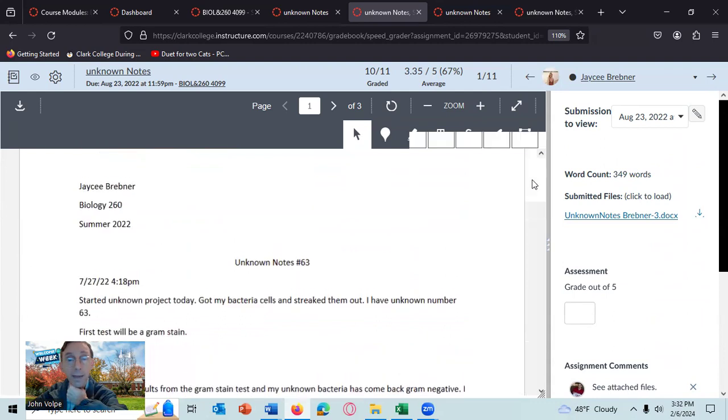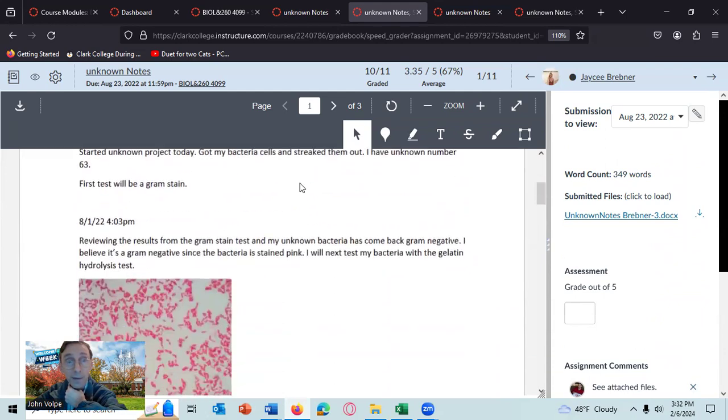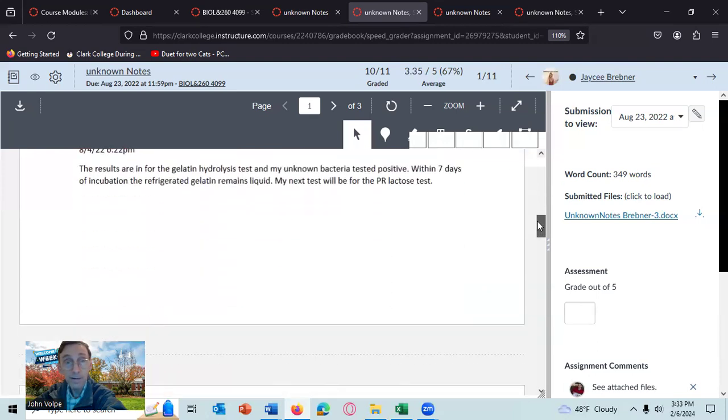So you don't need to name all of them at the start. You could say under consideration is all the species. And then after the gram stain, you should put 11 or 12 possible species. He could just say all the gram negative species are under consideration. But then with the gelatin hydrolysis test, there would be like 3 or 4 species he should name.